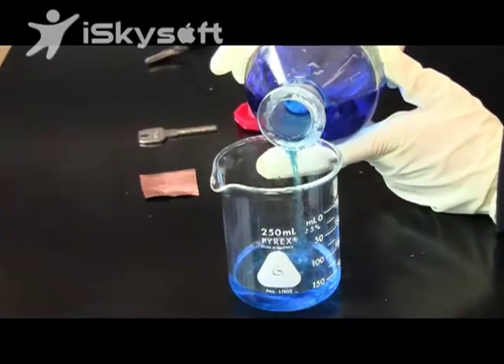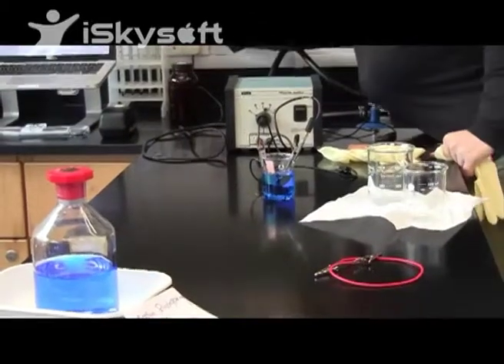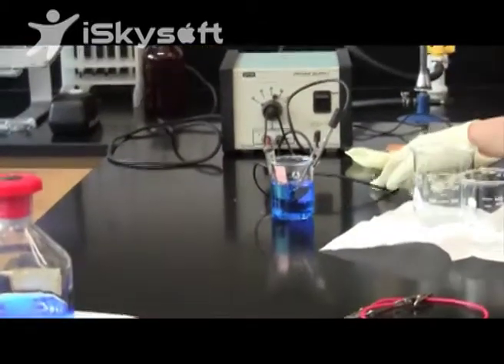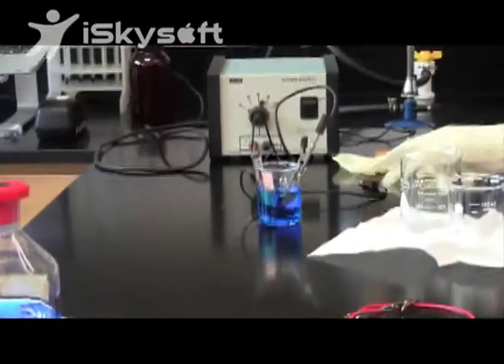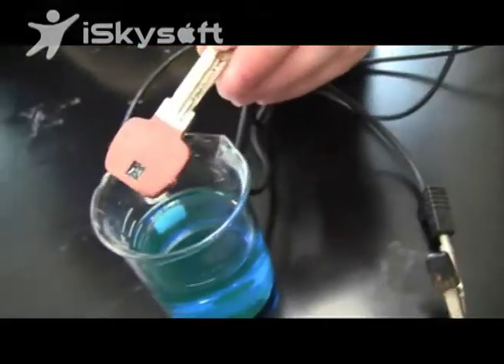Electroplating is a process in which a material is coated with another material, usually metal, to increase its usefulness. Join us as we delve into the details of electroplating and observe an experiment as a stainless steel key is coated with copper. Watch as electrons are transferred through the blue solution and stick to the stainless steel key, successfully completing the electroplating process.